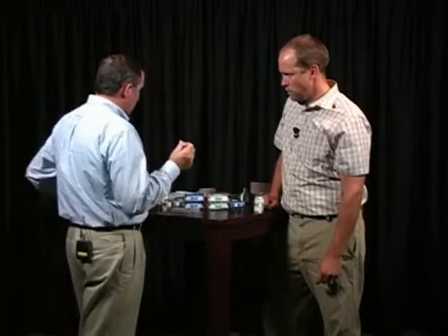I've seen inspectors actually push the thumb down. You know, they're on the wall, put it up there, and take it off. Not a good idea, because if you do that, you can imagine you're going to pull up a lot of dirt, wallboard, and substrate that you don't want, that obscure the spores, and most of all, you don't want to go up to Mrs. Jones' wallpaper and pull the wallpaper off. Now you've got a bigger problem.